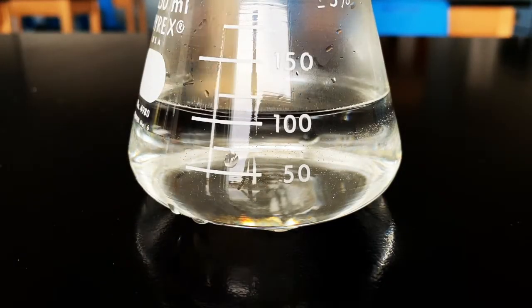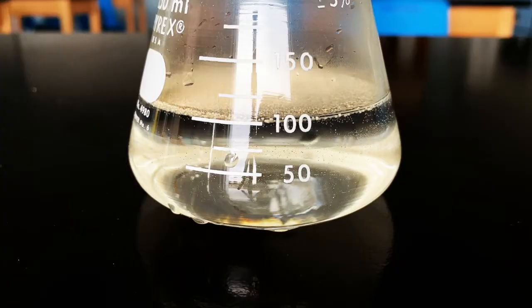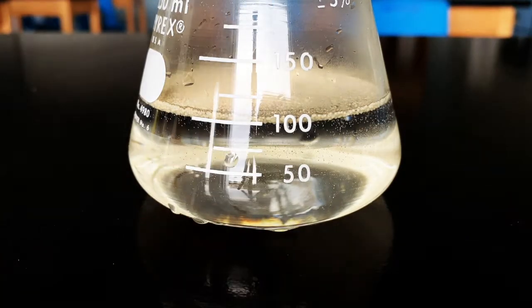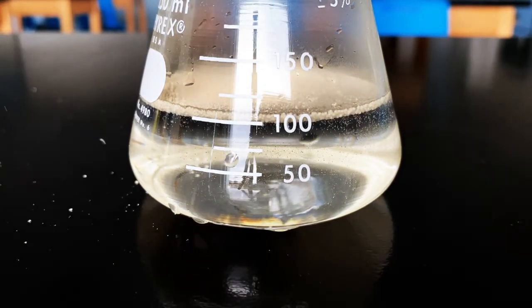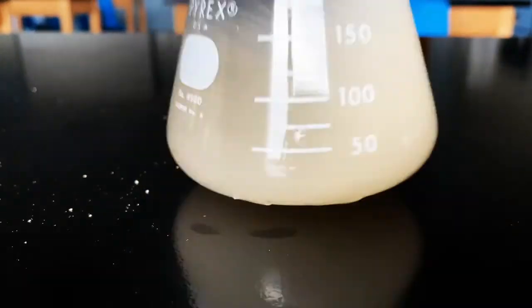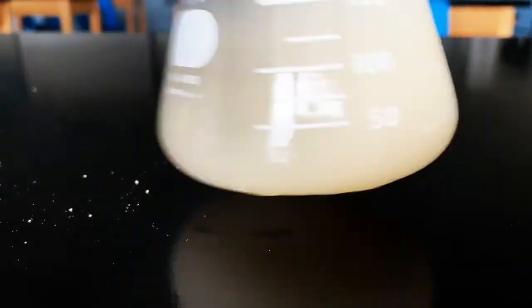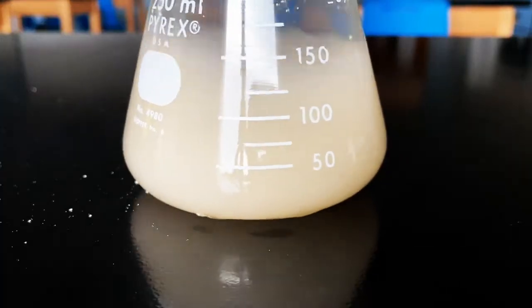First, mix about a half a teaspoon of yeast with about 100 milliliters of warm water in your flask. Stir it really well, then let your yeast sit for a few minutes. Your suspension of yeast should look something like this.